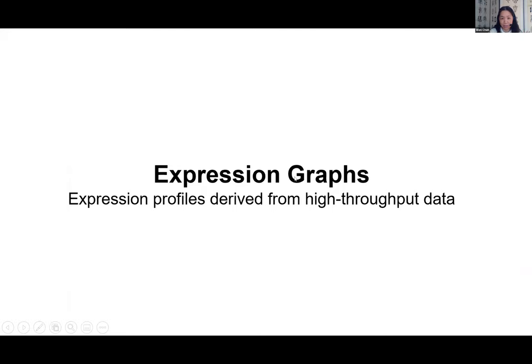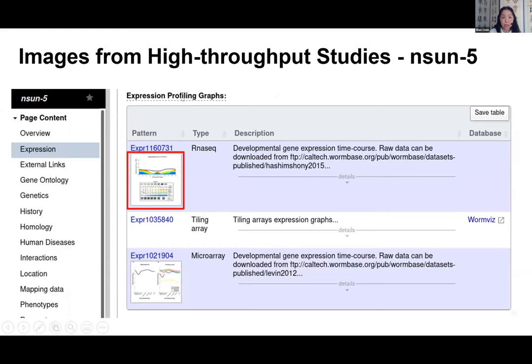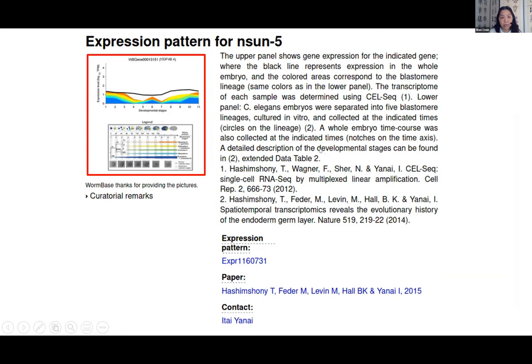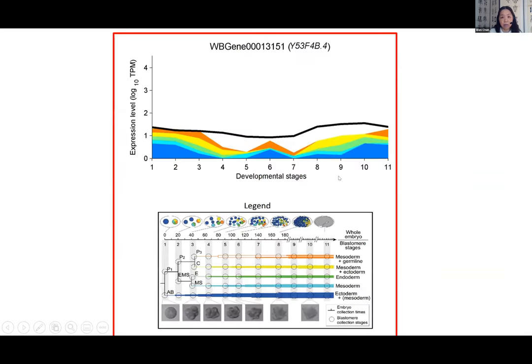Under the expression widget there's also a section called Expression Profiling Graphs, with images visible on almost every C. elegans gene page. These are picture files submitted by authors, mostly about life stages, from studies using microarray or RNA-seq. Clicking on these graphs shows you legends prepared by the authors. Clicking again shows details about expression level changes across developmental life stages — all picture files and legends submitted by authors from high throughput data.